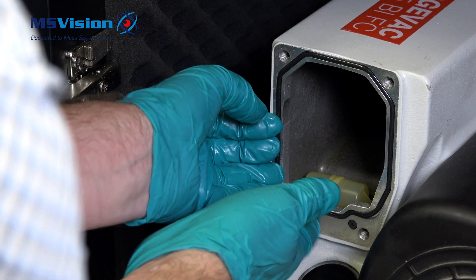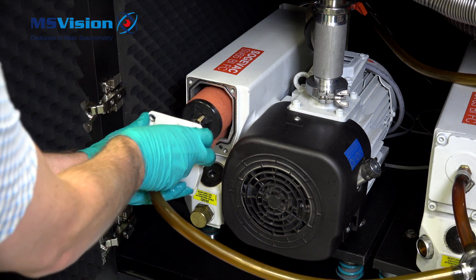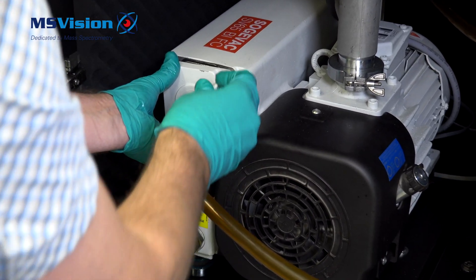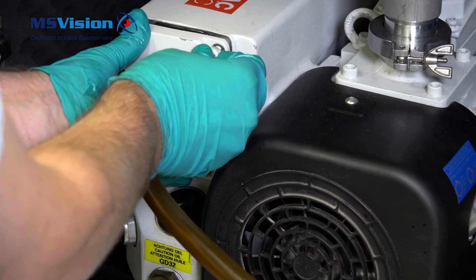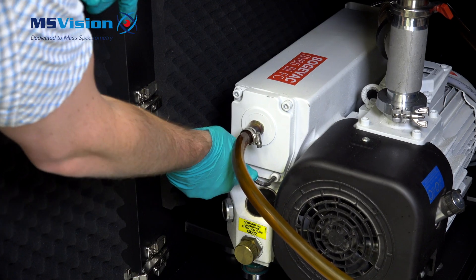Refit the gasket ensuring it follows the groove. Reinsert the filter with the flap facing down for oil to drip from. Evenly tighten the four bolts to ensure a flush fit. Clean the area to complete.